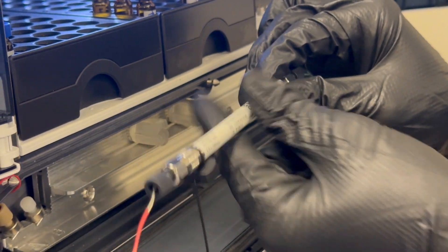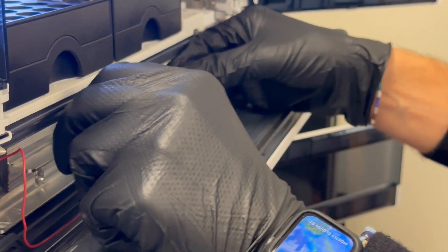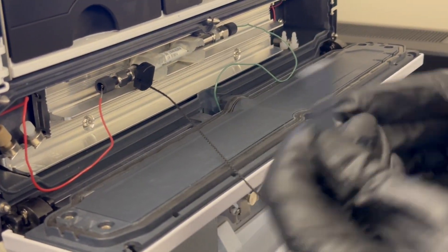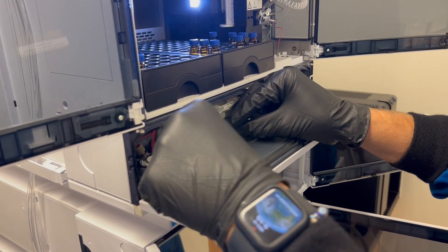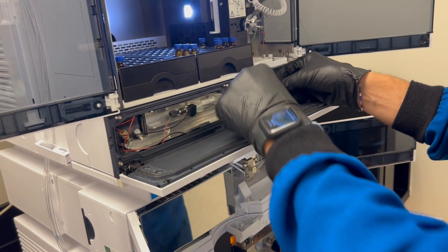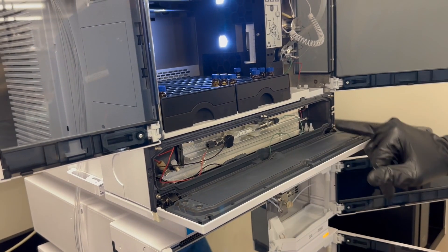Now that both of these are finger tight and they're in the proper direction of flow, we just want to make sure that these aren't going to change how they're seated — and both of them feel nice and secure. You can put them in the column holder here. This is an RFID tag, so the instrument software will automatically read what column is installed. You can even write methods that won't work unless a specific column is installed — that's more important for quality control environments, but it is an option. Now we want to go ahead and start our flow so we can check for leaks.